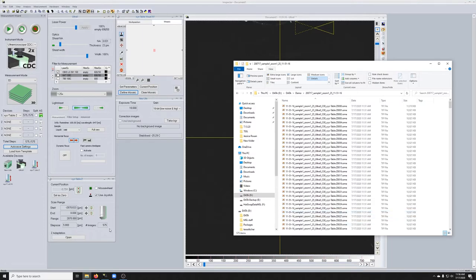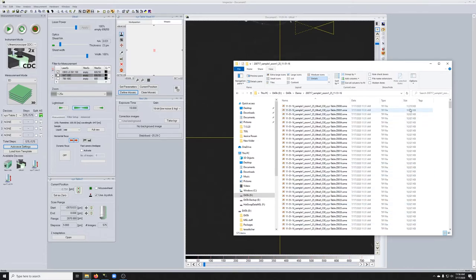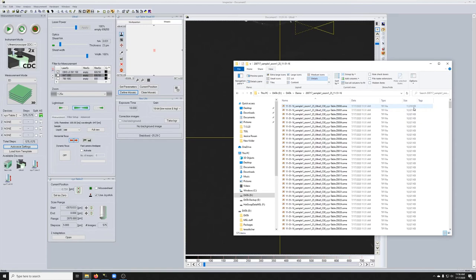There were 575 images in Z. Therefore, there are 575 items in this folder. You can also see if you look closely that the size of the very first one is a little bit bigger. That's because the very first one in the set has the metadata for the entire data set.